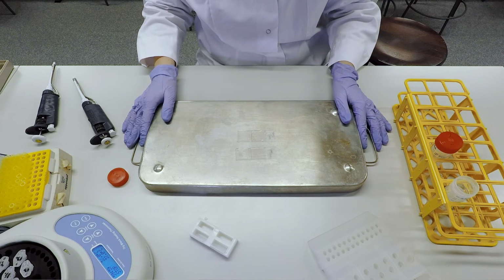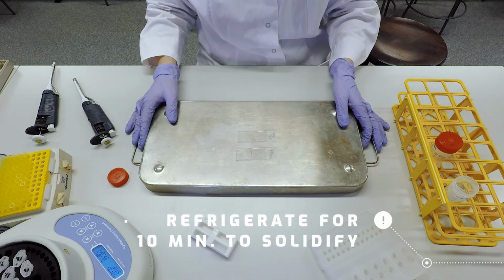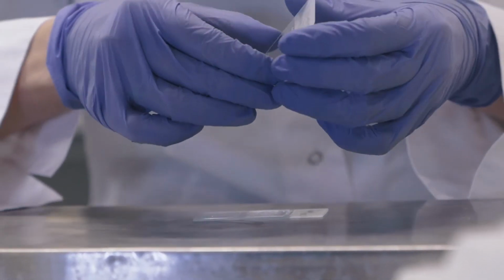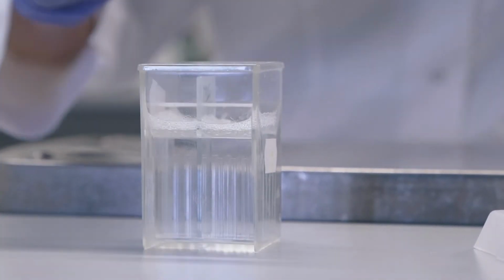Now I will put this cold metal tray back in the fridge for about 10 minutes maximum to solidify the gels. So after the gels solidified, we can remove the cover slips. And then we will put the slides in lysis for at least 1 hour.